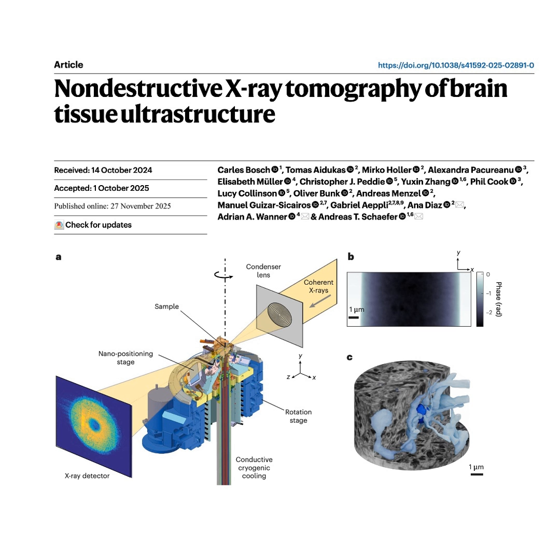And this is where we want to turn to you, the listener, with a final provocative thought. Okay. So, given that this new technique is fundamentally non-destructive, it allows the same intact sample to be used for multiple types of imaging. You can do X-ray, PXCT for the structure, and then maybe something else for the function. Right. What are the most exciting potential correlations this opens up for future research?